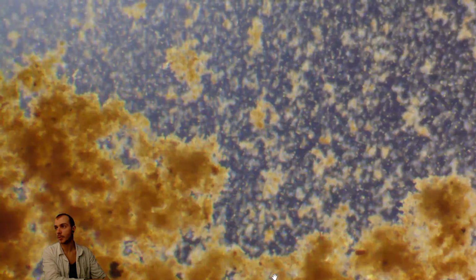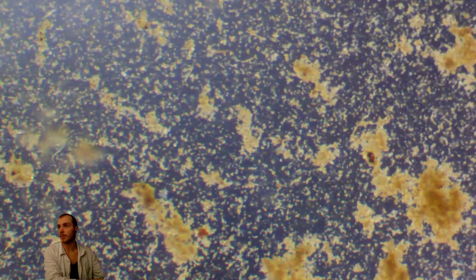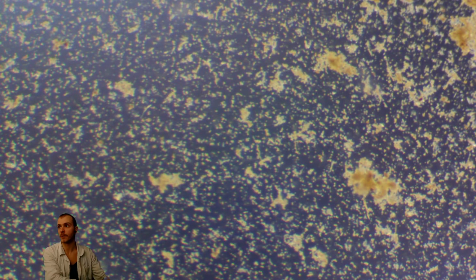So this is not from my aquarium, but from a jar. But it is from the same source as the water from the aquarium. The aquarium is a little bit of a mixture of more water samples, but the big part of the water is just from Oravas water dam here in Slovakia. Fresh water sample.